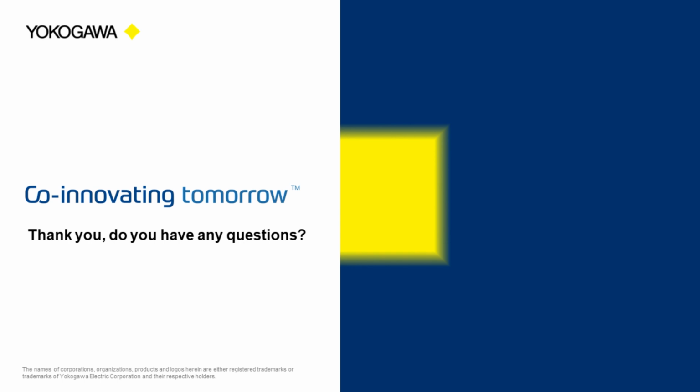So I think being able to use it for these very specific spatial experiments where you need to really zoom into the detail of what's happening, whether that's cell-to-cell communication or bystander effect here, that's where the desire for a system like this comes in. But to answer the question in terms of how many we're planning for the paper, looking at the radiation-induced bystander effect, it's going to be about 15 to 20 cells in each condition. So relatively low n number. But some of the mass spectrometry data we're seeing out of that is still quite compelling, even with a low n number.